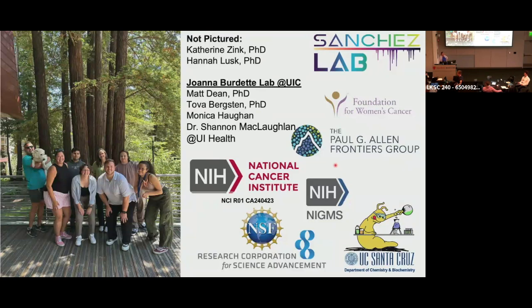Yeah, there are some projects. I think we found the ion mobility for some molecules that need it. It's great, but we don't. I think some of the things that Kylie brought up earlier is the data sets just become unwieldy. So we turn it on when we need it, but otherwise we've just found that it makes the data way too big to handle. So yeah, we have some examples, like not in what I've shown you here, but there are some where it's critical.